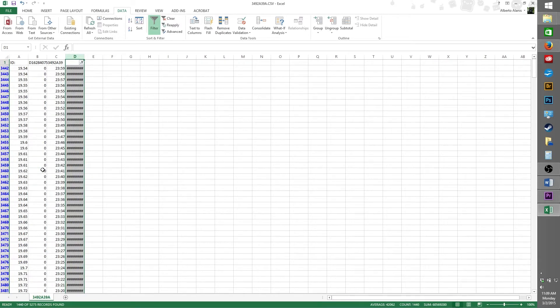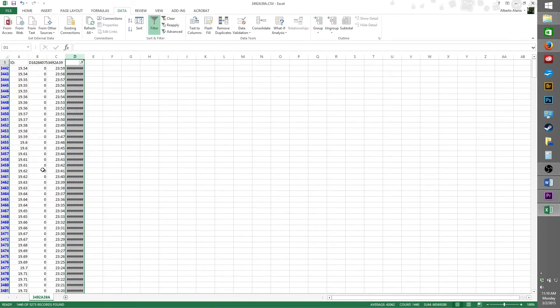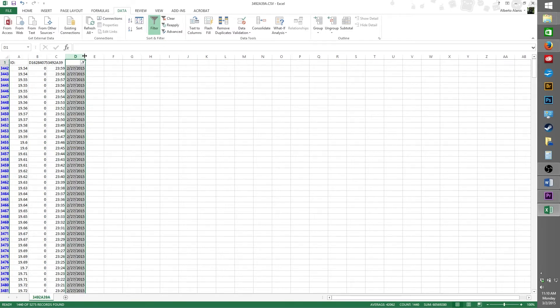Once you have done this, Microsoft Excel will automatically filter out every other option except the one you chose. So now we're looking at all the data that was stored only on February 27, 2015. If for any reason your data shows up with a lot of pound signs, go to the end of that column and double click until it turns back to normal.